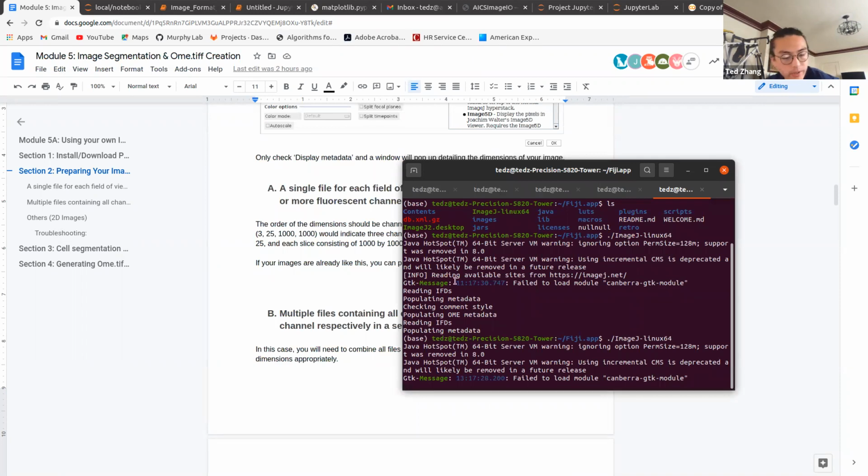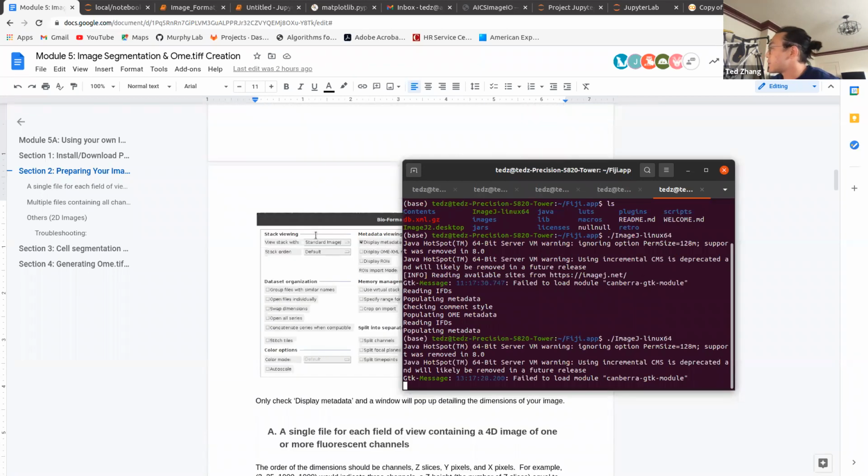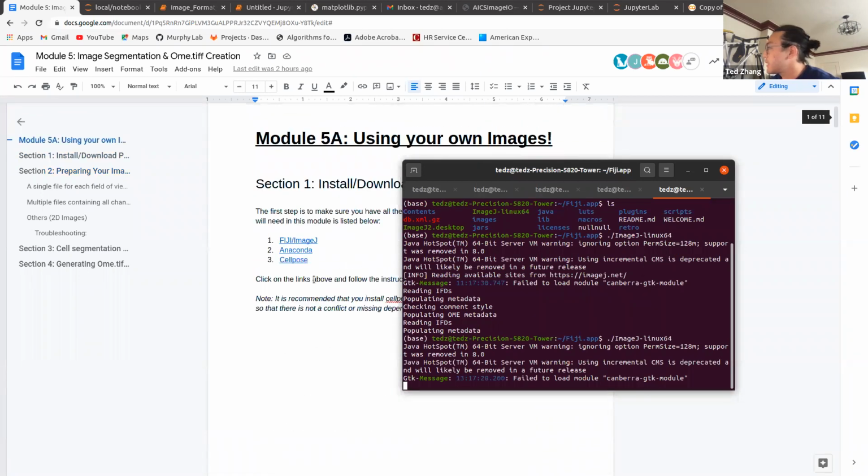There's a bunch of different segmentation methods. I feel like it's an open-ended field right now of how to segment images, like computer vision in general. But the one I chose is a pretty popular one currently: CellPose.